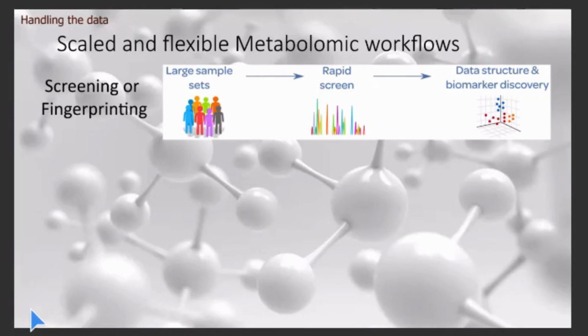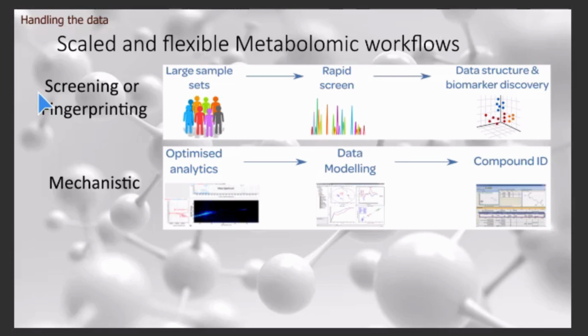Once you've got metabolomics established in your laboratory, you've then got different flavours you can think about working at. You may want to do rapid screening of large samples, maybe animal populations, human populations, plant populations, cell populations. We can do that rapidly by what are called fingerprinting techniques, where we're trying to move quickly from our data acquisition stage to plotting some of these types of statistical relationships, with really not much interest in actually identifying what the compounds are. We just want mathematically significant patterns.